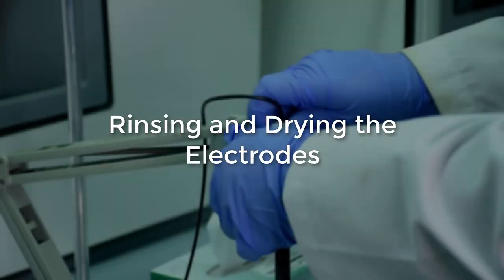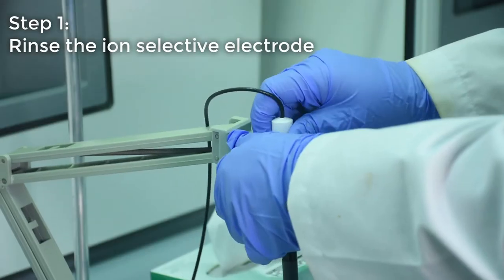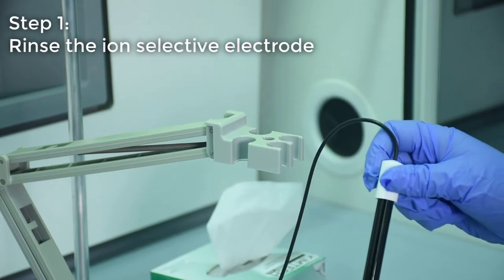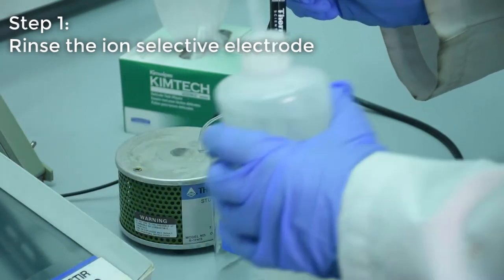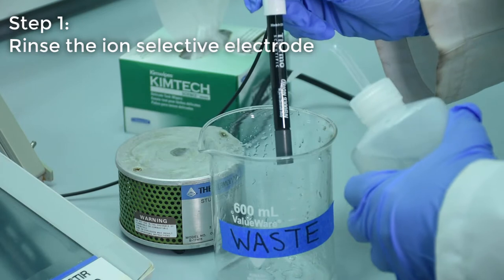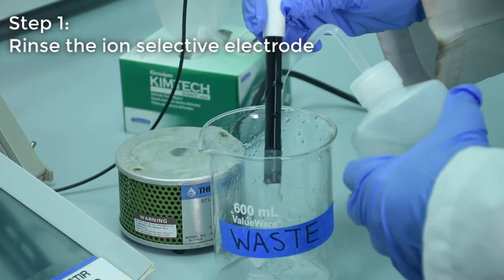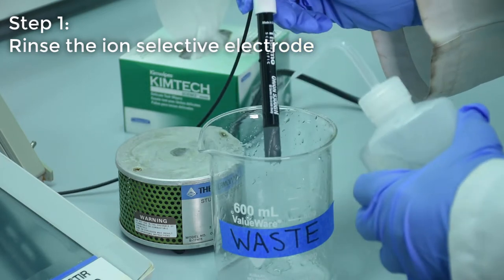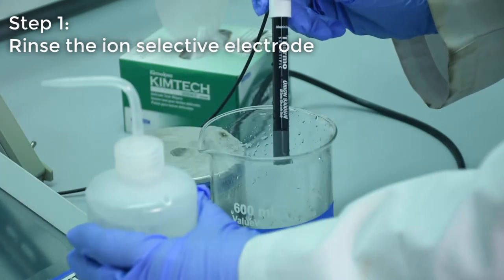Before we immerse the electrodes into the solution, we need to rinse them. Remove the ion selective electrode from the stand. Use a squirt bottle with deionized water to rinse the electrode over a large waste beaker. Rinsing the electrodes minimizes cross-contamination between residual contaminants on the electrodes and our sample.